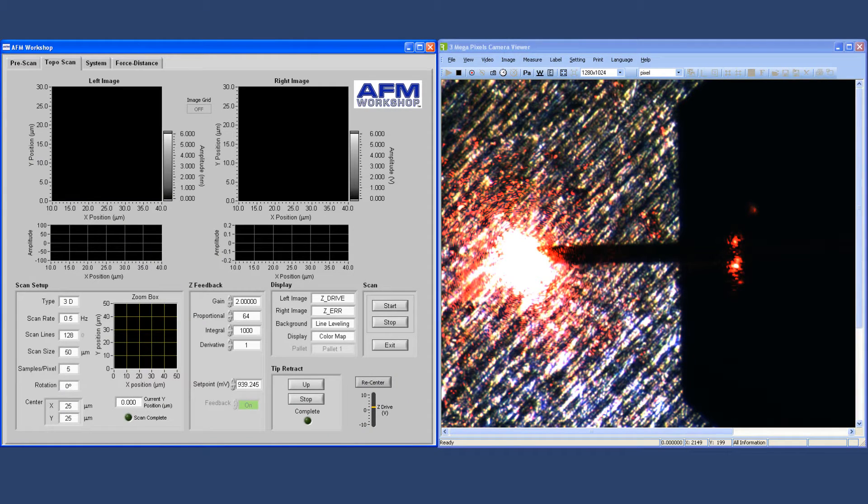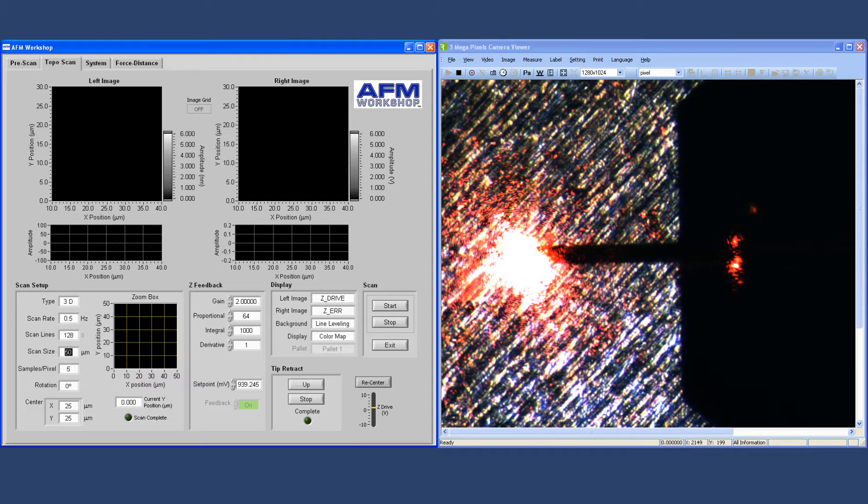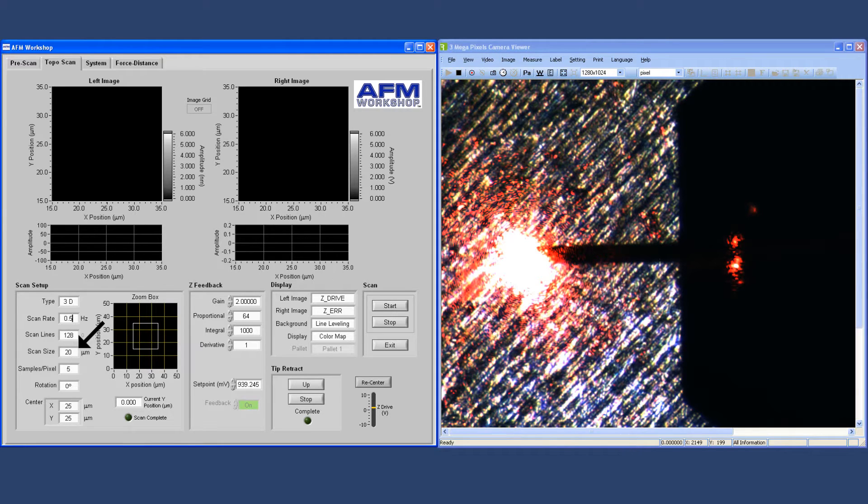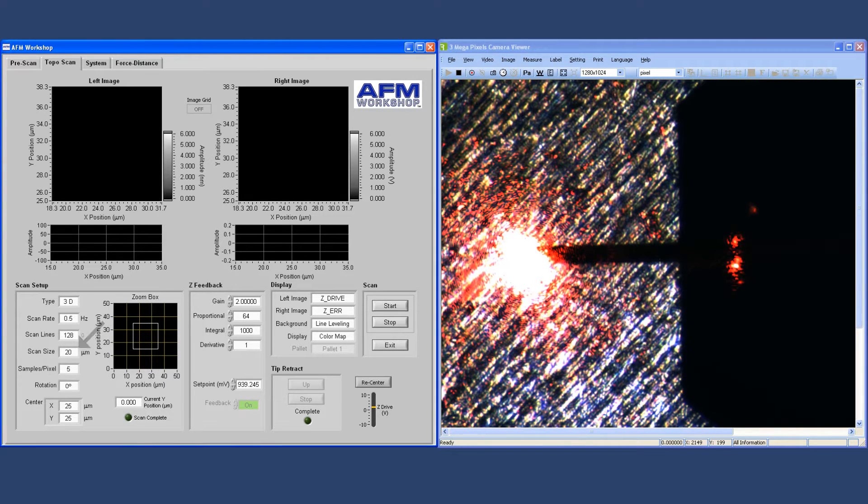We go to the next tab and we can set some scan parameters. For example, here we're going to do a 20 micron scan and the scan range is shown on this box. Once that's done, we can begin scanning.